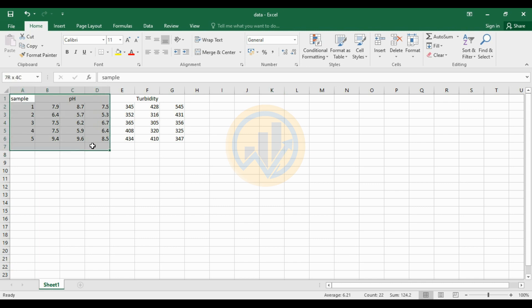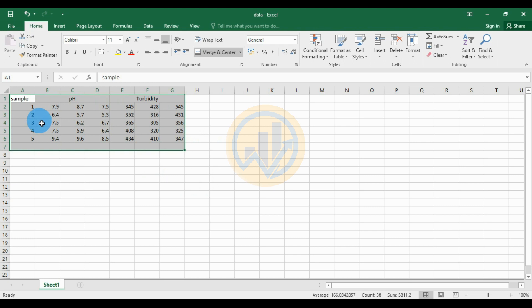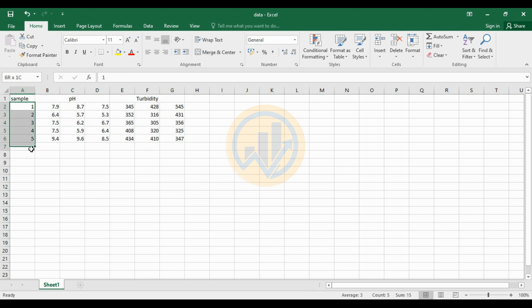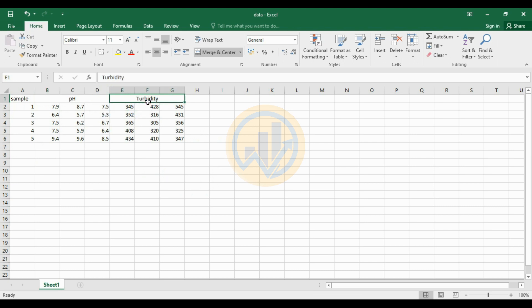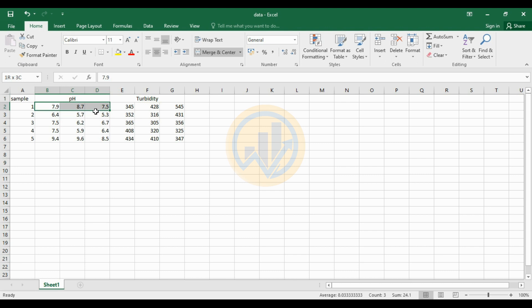This is the dataset for the double Y-axis bar graph with standard deviation. We take 5 samples in 2 groups. The first group is pH and the second one is turbidity. Each group has 3 times replication across 5 samples.